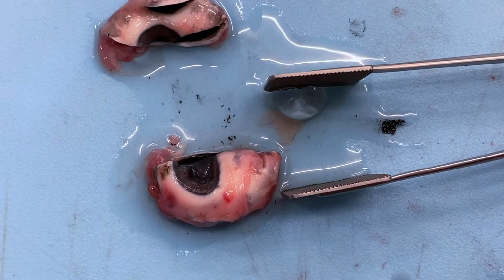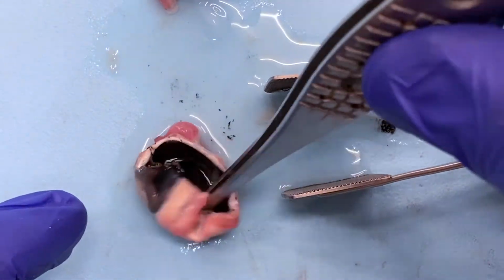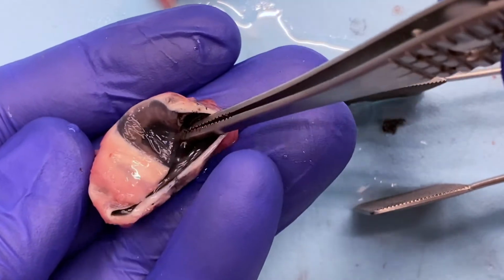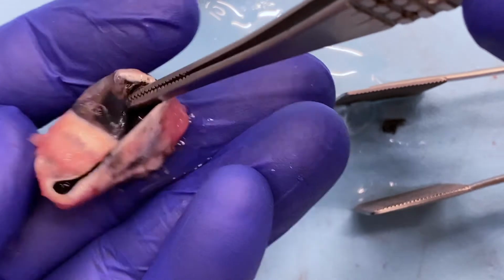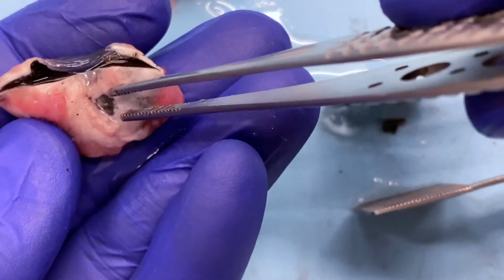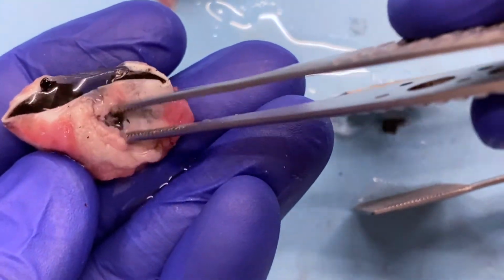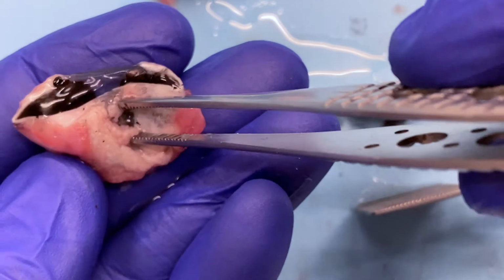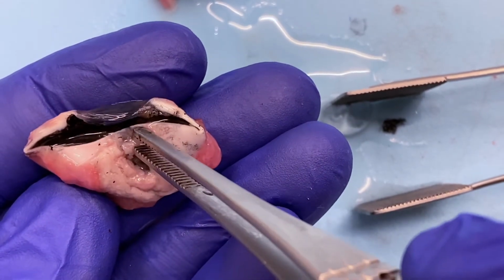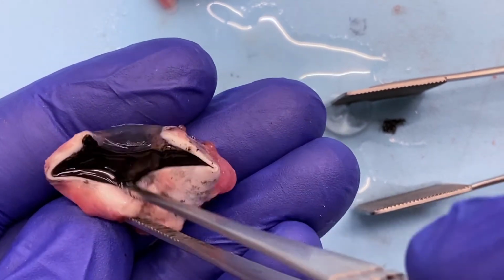Okay, so I've cut off one half of the eye here, and I'm left with the other half. And basically what I'm looking for now is I want this part to be contained in my cassette, so this is going to be where my pupil is, and I want to make sure that my optic nerve is contained. So as you can see, posteriorly I was a little bit off, so I can trim that up and do some adjustment after I make my section. But that means I'd rather be on that end where I have a little bit extra I want to cut off than to have cut through my optic nerve initially and have less to work with.